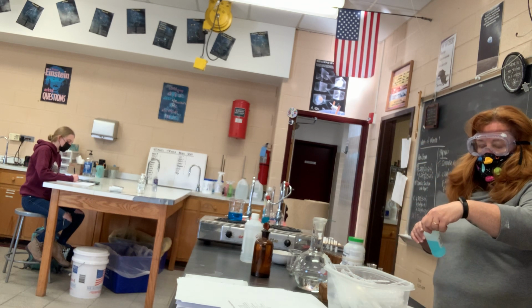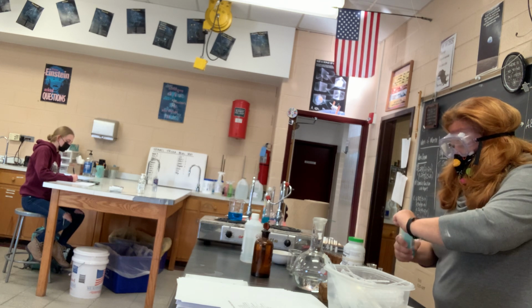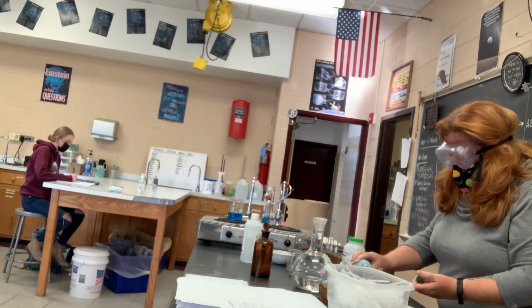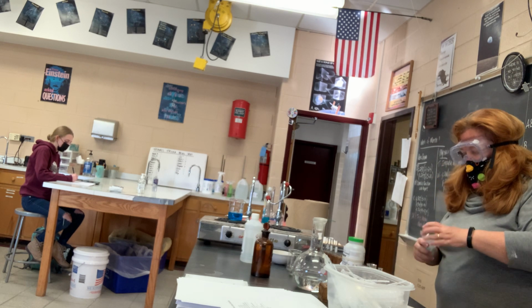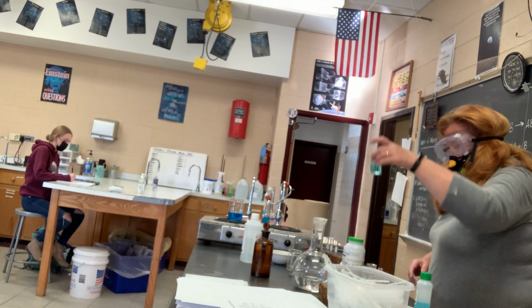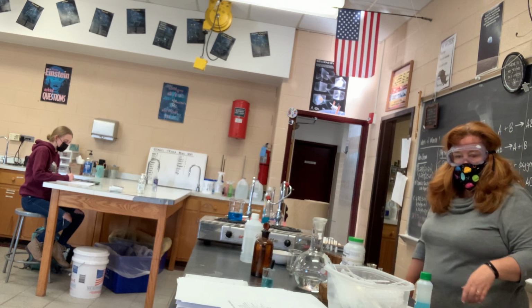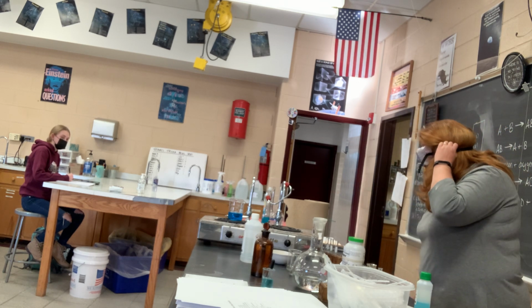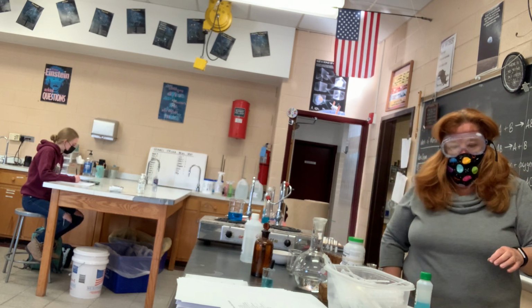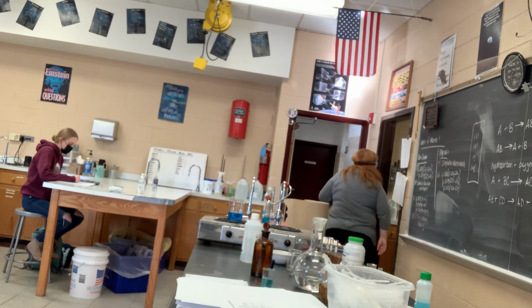So I've got more copper sulfate, which is that blue liquid. This one just isn't as concentrated. So for the last one, copper sulfate solution, just like that one, is not quite as concentrated. Blue, kind of transparent, definitely a liquid. Sodium hydroxide is what I'm going to add to this as soon as I find it.